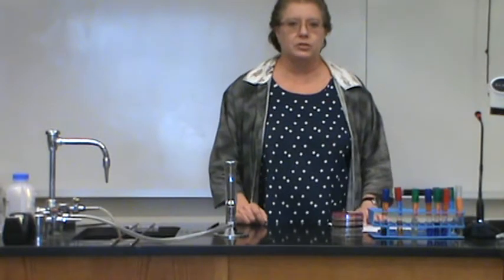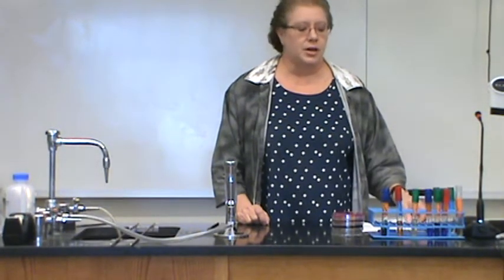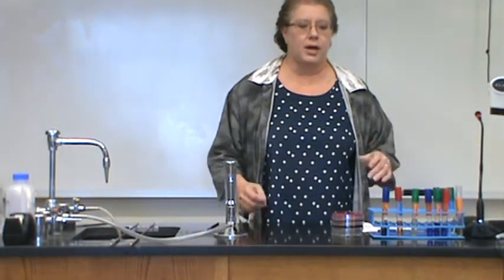So today we're going to learn how to identify an unknown bacteria, identify what species it is. You're going to be using a range of tests to identify a bacteria. These bacteria unknowns have either been cultured from a skin wound or a fecal culture. So we're kind of doing a make-believe thing.